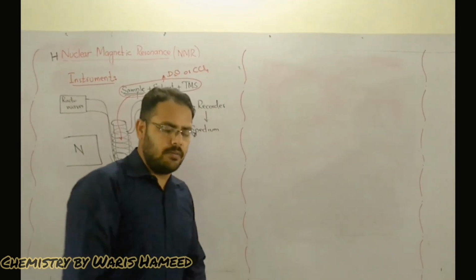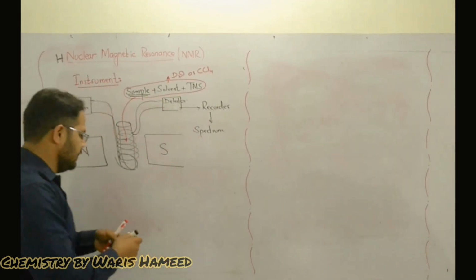How are signals formed? First I will explain about it.